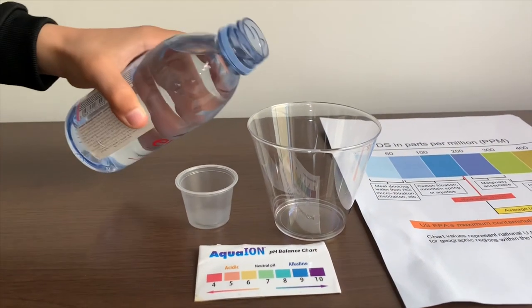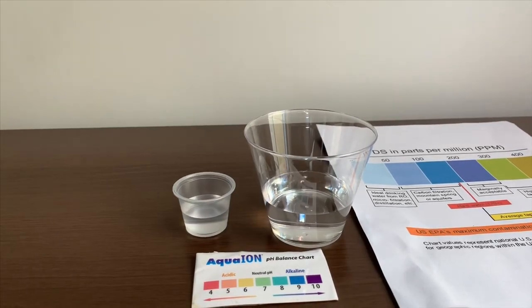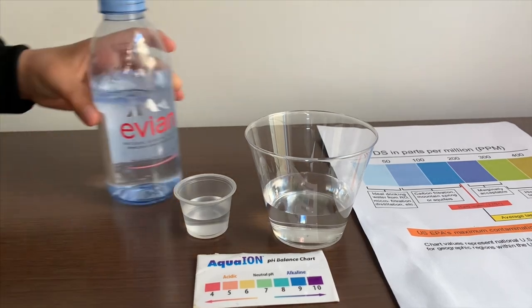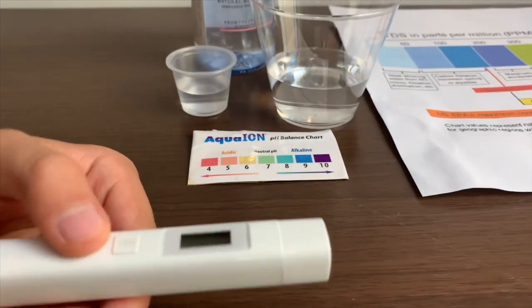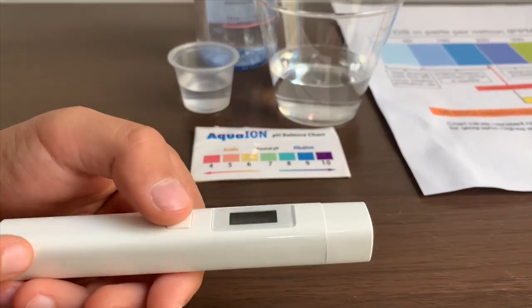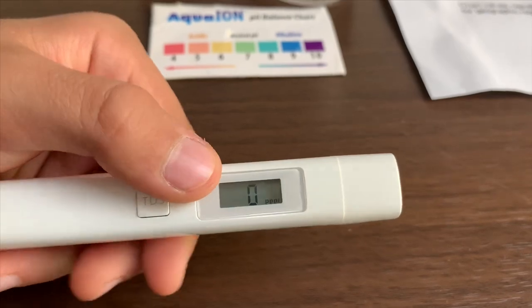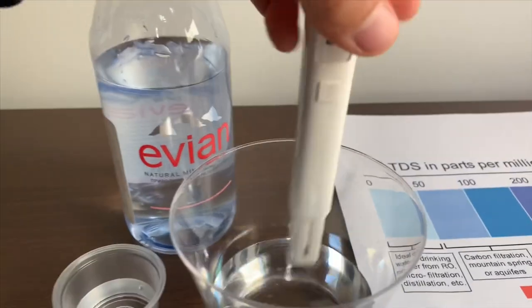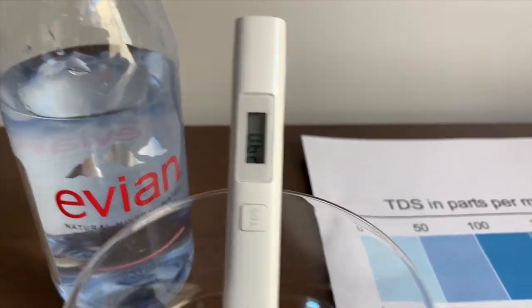Let's pour some water in. First, we're going to test the TDS. If you want to buy this TDS tester, check the link down below. Turn on the TDS tester, make sure it says zero, and put it in. 290. That is okay to drink.